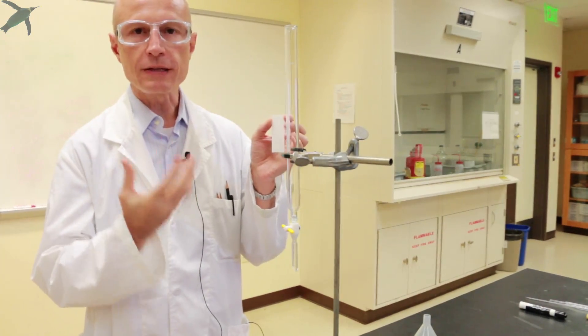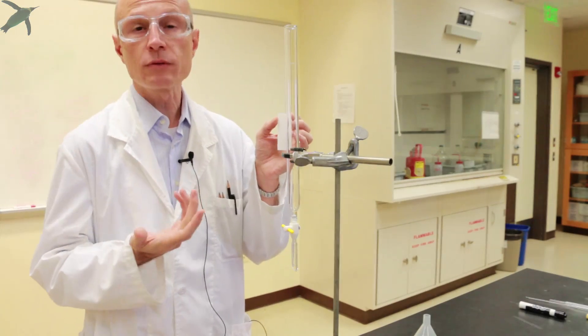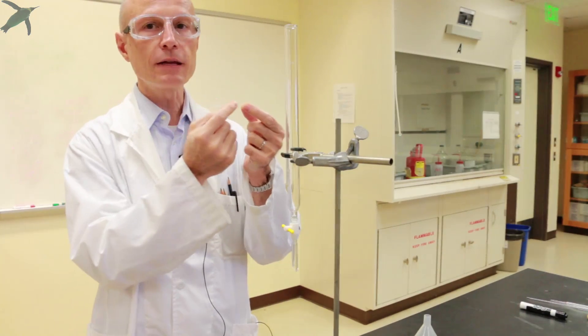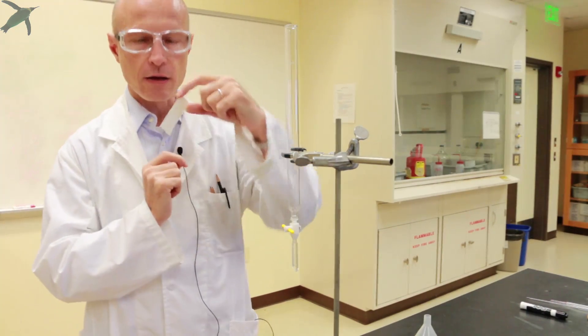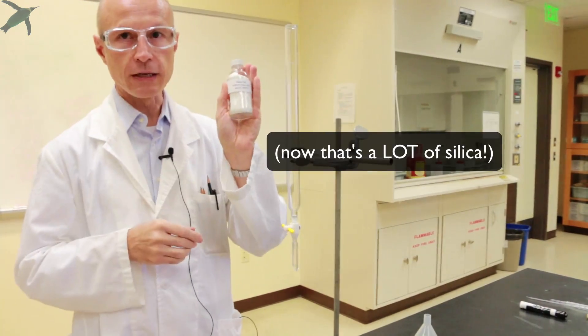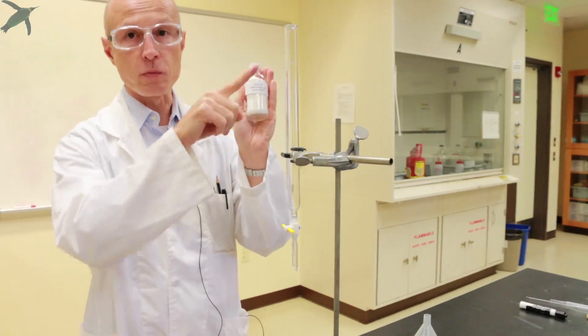If you want to have a sizable amount of compound, you have to scale it up. So to scale it up, you don't use just a very thin layer of silica on a plastic backing, you use a lot of silica and you pack a column of it.